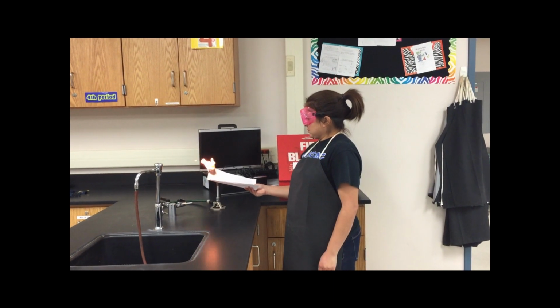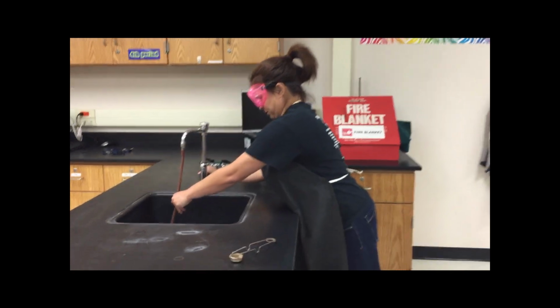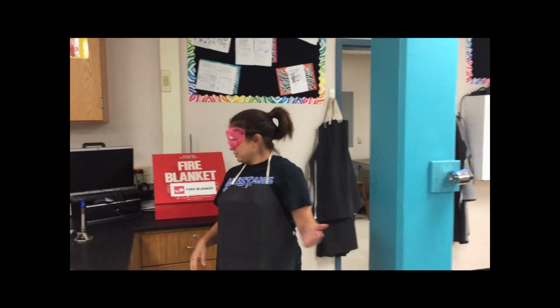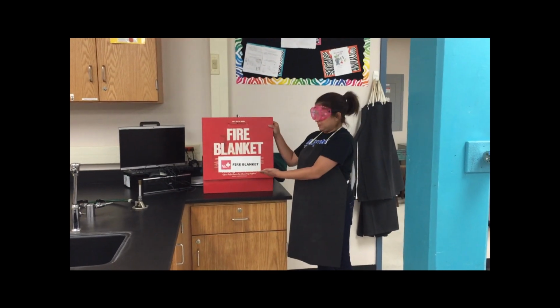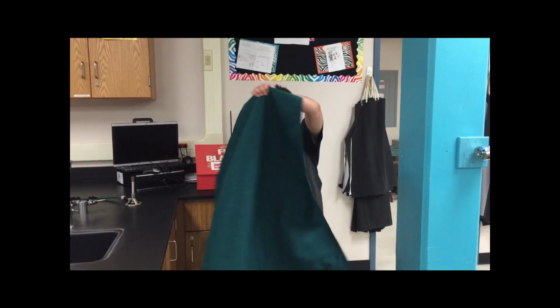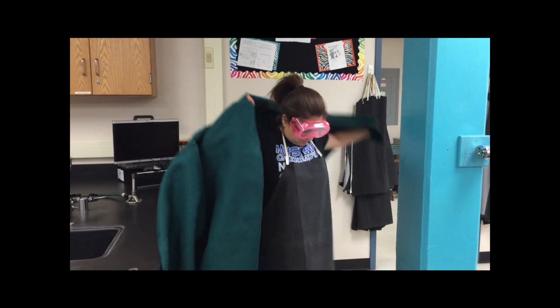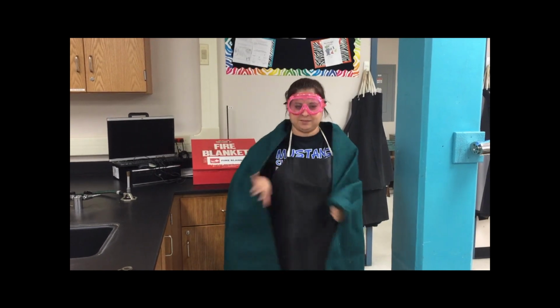If there is a paper fire, make sure you place the paper into the sink and turn on the water to put the fire out. If there is a trash can fire, you must use the fire extinguisher. Always turn off the Bunsen burner when not in use. If you catch on fire or your clothing, make sure that you grab the fire blanket, wrap it tightly around yourself, and pat until the fire is out.